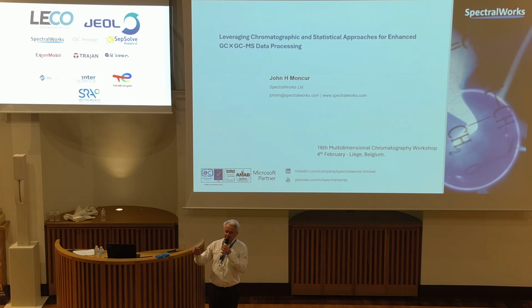To snip the end off a glass column, you needed a blowtorch and a lot of luck because it was just hard work. Then fused silica columns came on board, so much better, and really are now the gold standard of what we use. So that's the chromatographic side. I'll try and explore some of the peak detection type of things that we'd be doing on that.